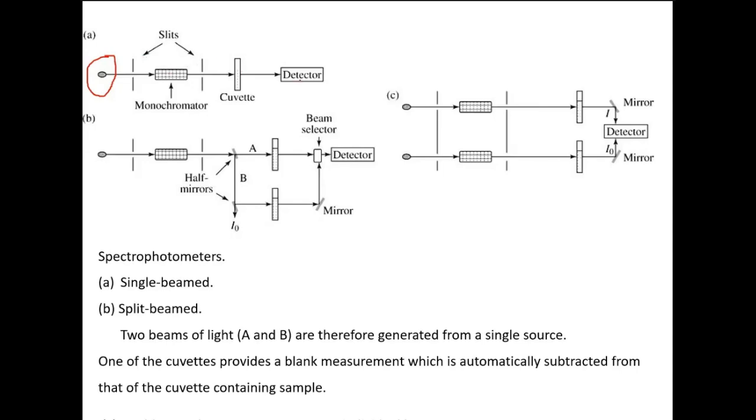and detector. Because of the advancement in science, scientists developed the split beam spectrophotometer.